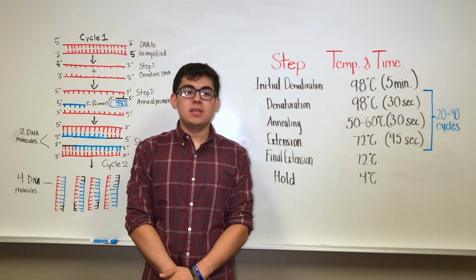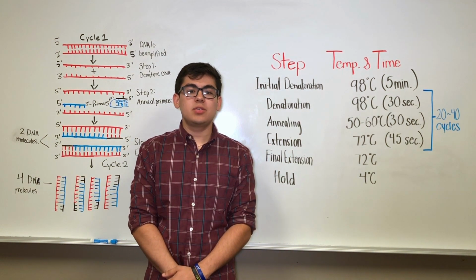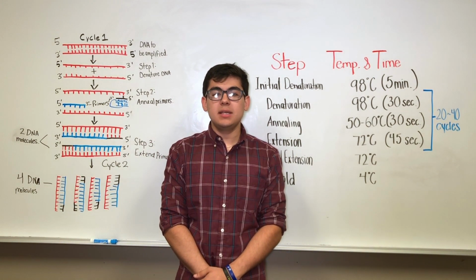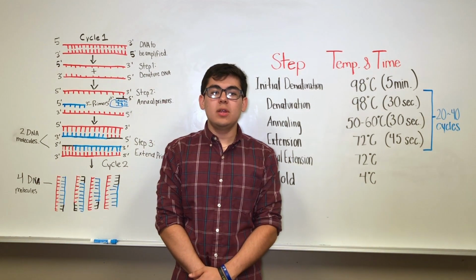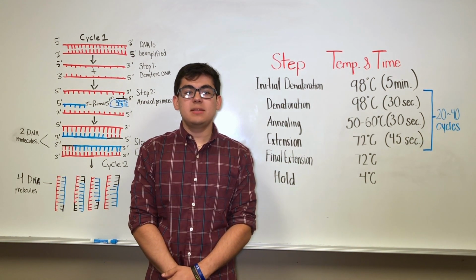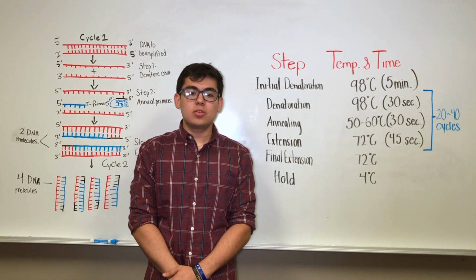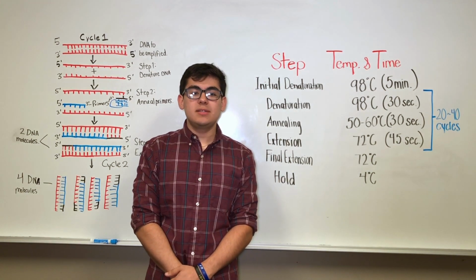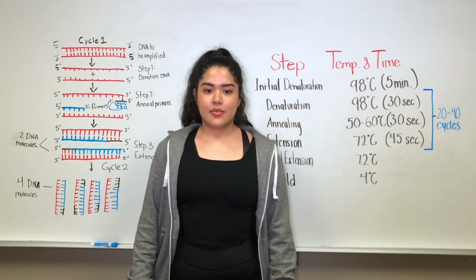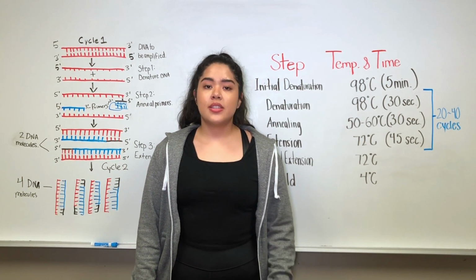The laboratory exercise requires a microcentrifuge, 2 heating water baths, gel electrophoresis equipment, power supplies, horizontal gel boxes, trays, and combs. 1 or more thermocyclers with sufficient capacity to accommodate the number of student groups will be used, as well as an ultraviolet light source with an ultraviolet protective shield needed to visualize the DNA bands. There are 5 simple steps in order to conduct this experiment using the DNA in question.